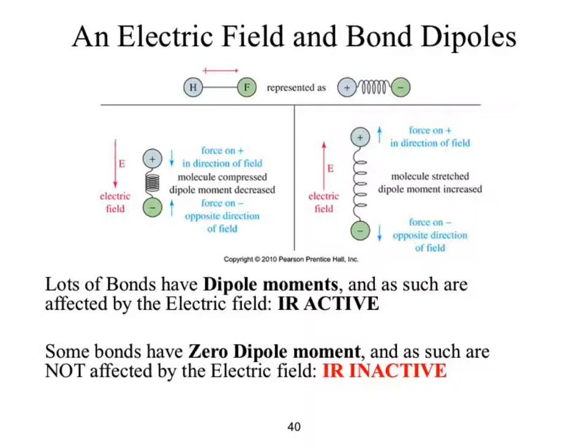And then IR, we started to look at some nuances within it. One that we ended on was the basics of what IR looks at. It's looking at bonds, and in particular, it's looking at bond dipoles. The larger the dipole, the more the compound will absorb that IR light, meaning we get a more intense signal. So if you go back and think about the intense signals within IR, the carbon-oxygen double bond is one of the most intense and most obvious signals in IR.